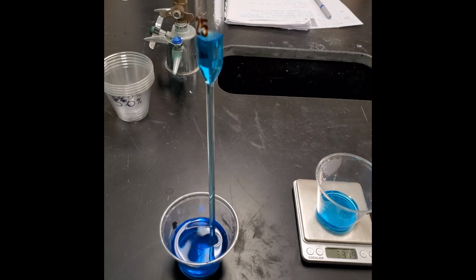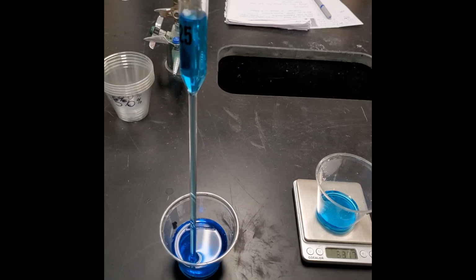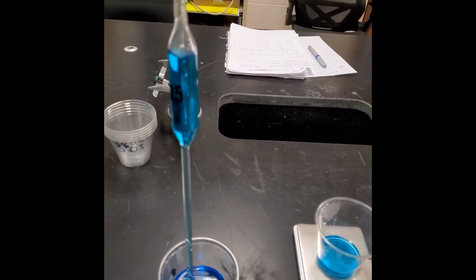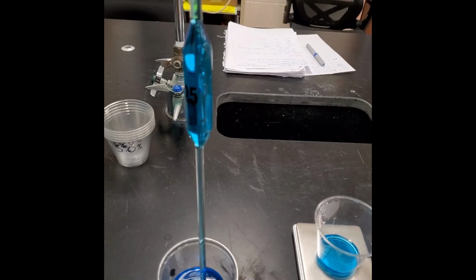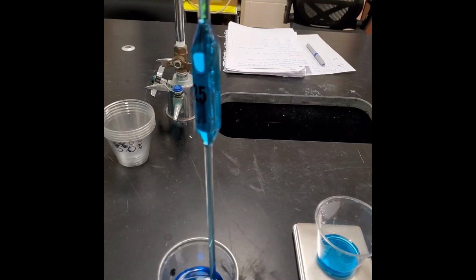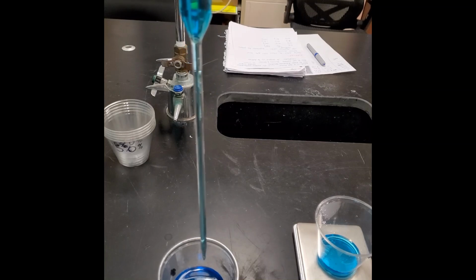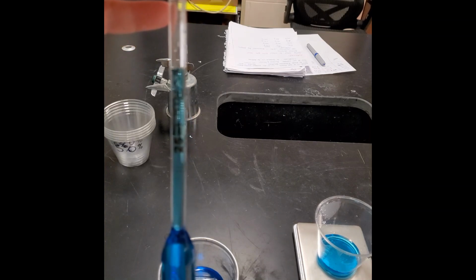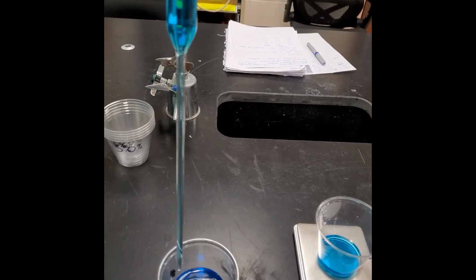I'll show you how to move the thumb one more time. So again, we're going to move it up so that it's above that line. Okay, and you notice how I take it out? Now this one actually is staying put, but I have my liquid above the line. If there's a good seal, you'll be able to dial it directly with the filler. If not, you do have to take it off and use your thumb. So I'm going to take it off and use my thumb.